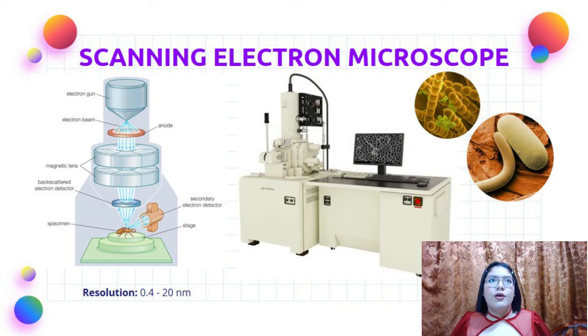Thanks to this type of microscopy, we are able to obtain superficial information on the shape and topography of the sample, its texture and composition.